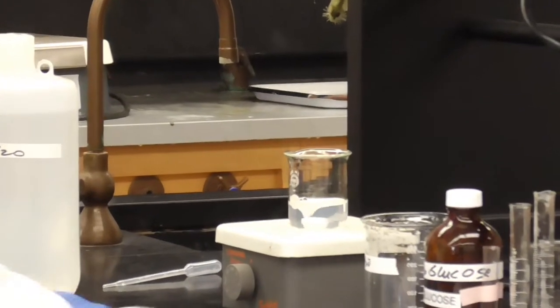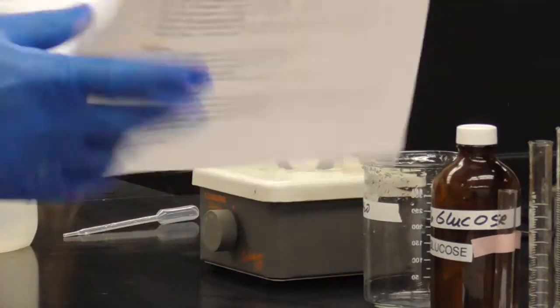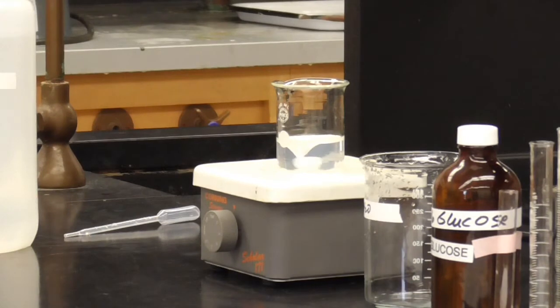All right. So why are we doing this? Before we get to the next step, which is about the dialysis tubing, we're doing this to show about osmosis and dialysis. And dialysis, in general, is the idea of some small molecules being able to cross what we call a semi-permeable membrane, whereas larger molecules can't.